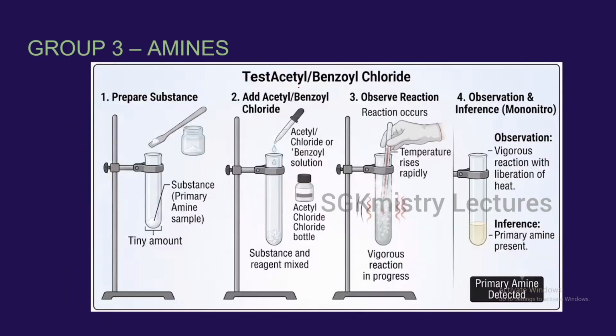So first of all, we are talking about acylation. So we're going to take, again, in this case, you have to be very careful. You're going to take a dry test tube.